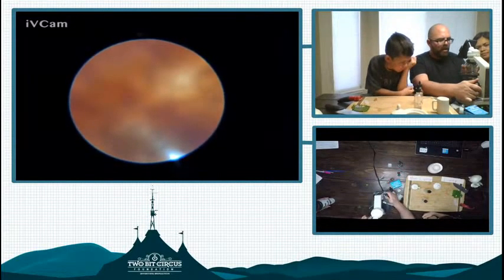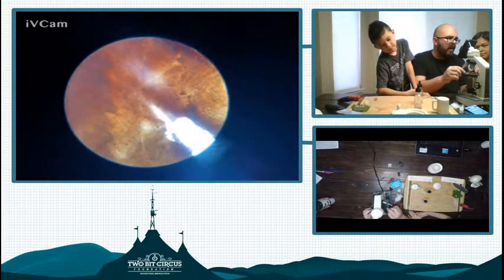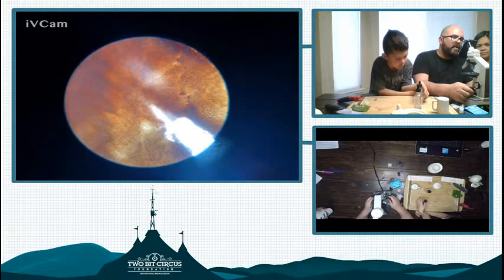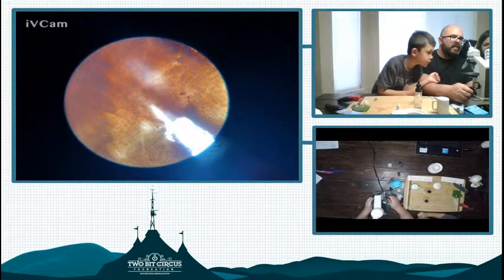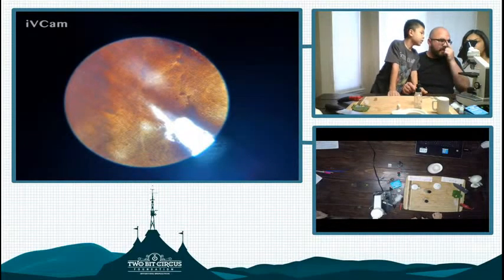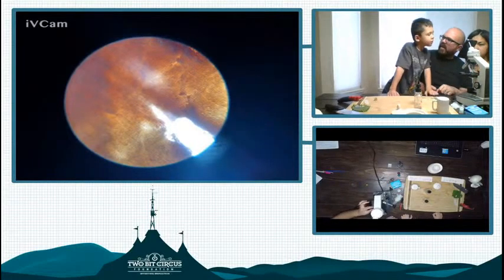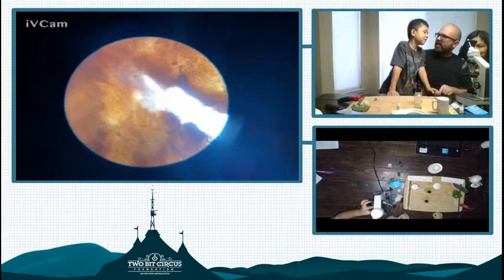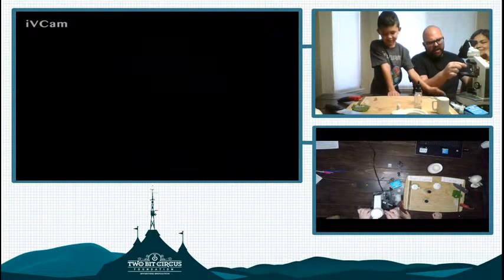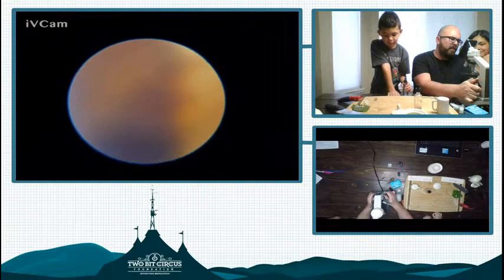Alright. So I saw in there a pattern, Robert. I could see it right there with that clean cut. Look at that. Robert, do you see that pattern? You can look there, you can even look on that screen. Can you see the pattern? Yeah, so what does that look like? They look like cells, don't they? No, but a cork bottle's not living. A cork bottle's not living, but maybe that's something we should think about. Where does cork come from?